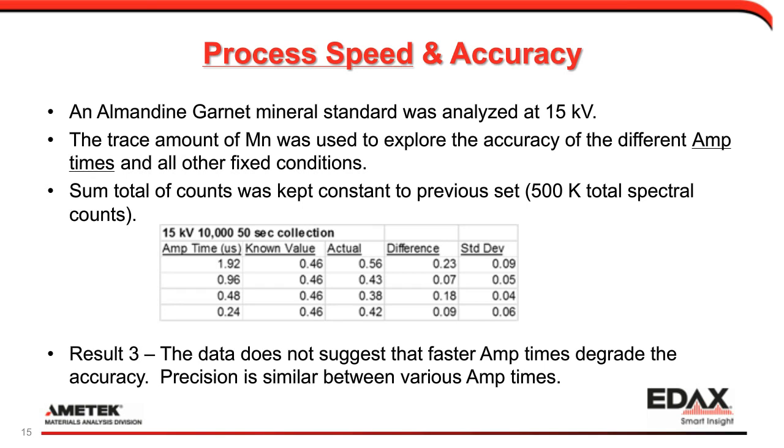So this is very good as a result to show us that you can work faster, which gives us lower dead time, which then gives you higher productivity, more counts in lesser amount of time.